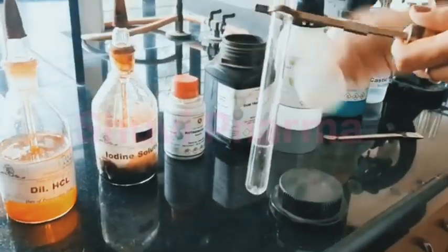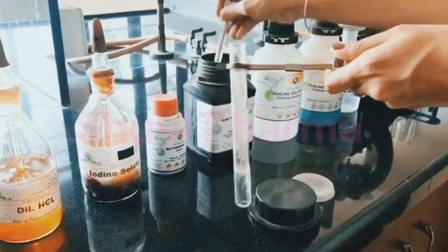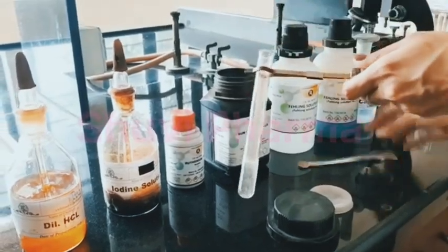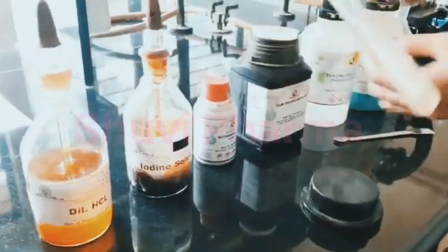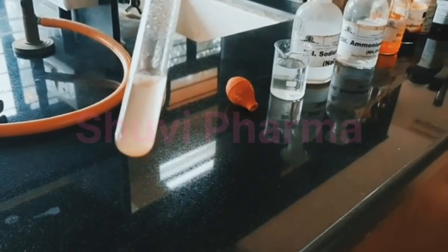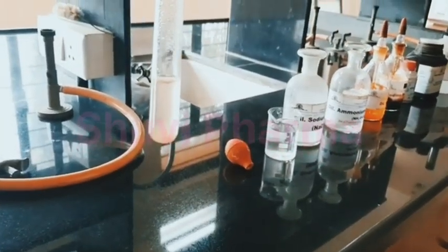For the second solubility test, warm water is taken into the test tube. To that we'll add tragacanth powder. Here you can see the drug is soluble in warm water. It indicates the presence of tragacanth.